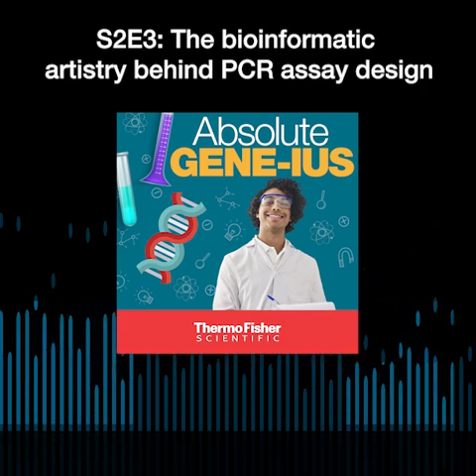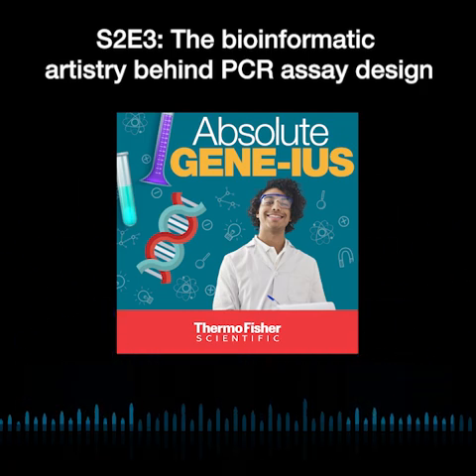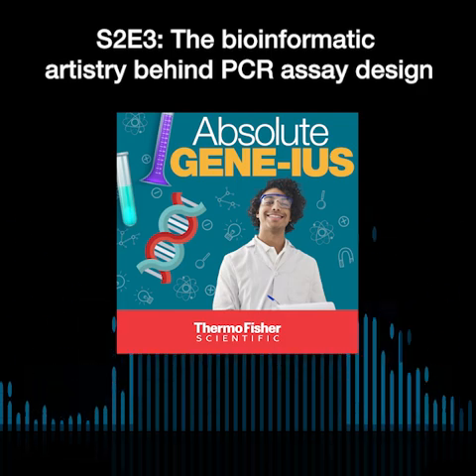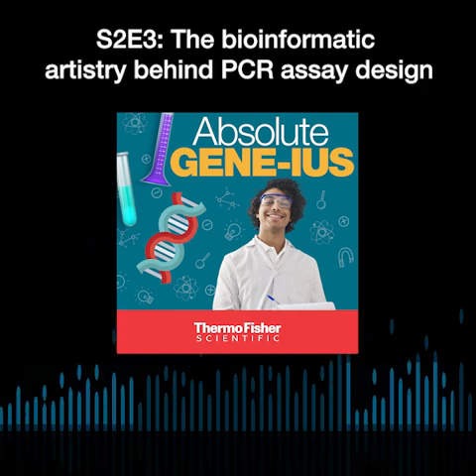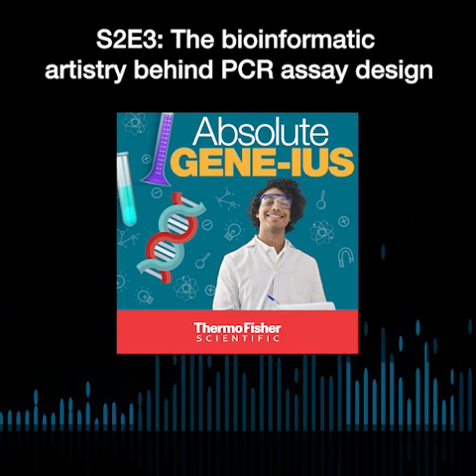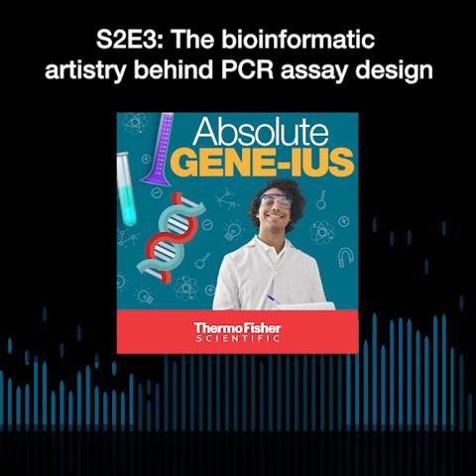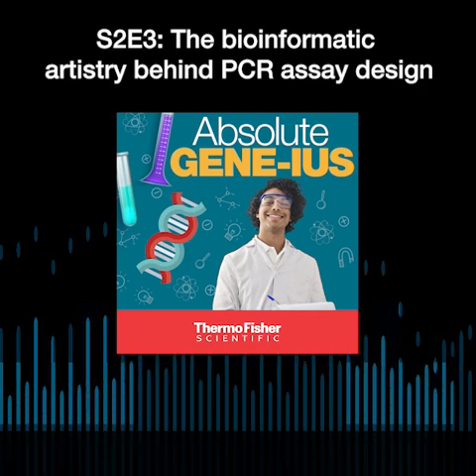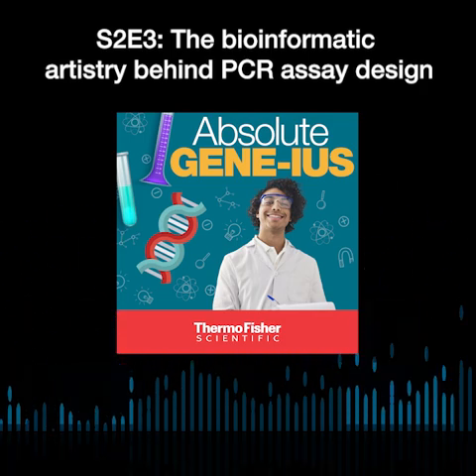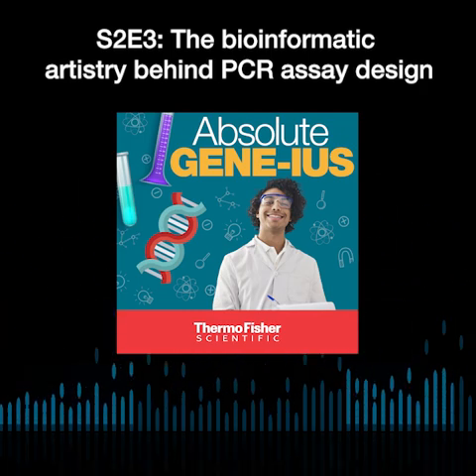Others I would think is the setup, for example, do you in future want to multiplex your assay with other targets? In that case, if you know this beforehand, that down the line that's something I would like to do, it's best to be upfront about it. Anything else you can think of, Kimi? I just thought of the general things that I would think most people are looking for, like specificity, and making sure you don't have any primer dimers so that your assay itself works and it's binding to only the target that you want.